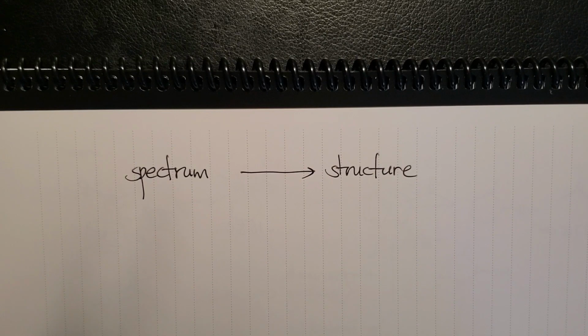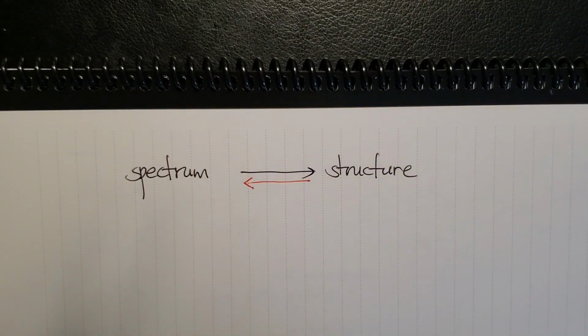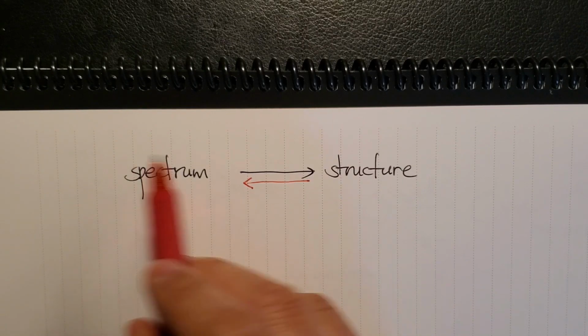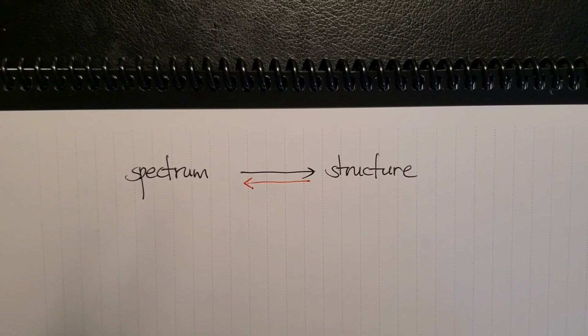Then after running the spectrum, as the printer prints out the spectrum, you match it with the structure you have in your mind before the machine is printing out. And then you know what isomer you got. So you need to also be good at deducing spectrum based on the structure. So let's try one example, and hopefully I can make more videos later.